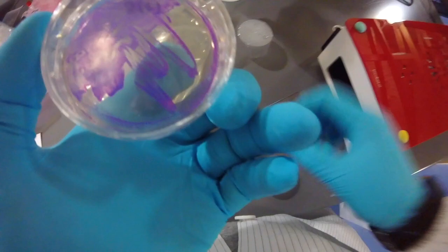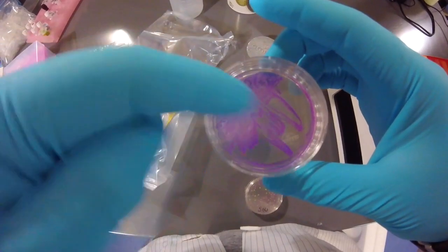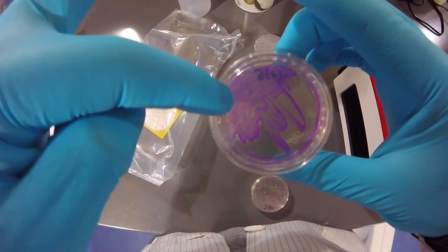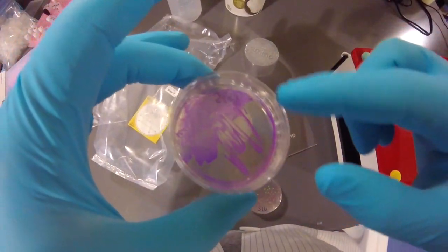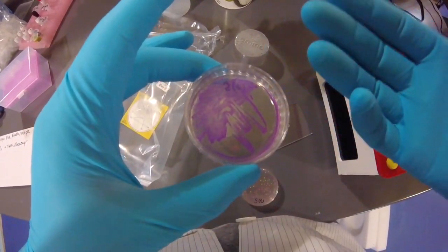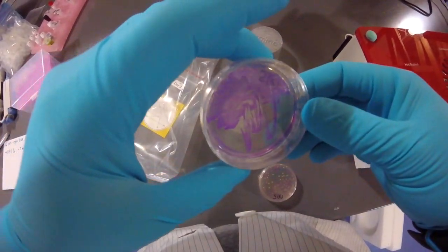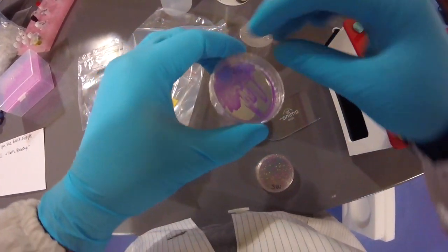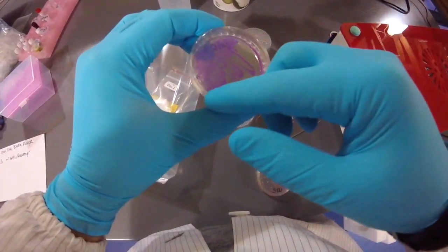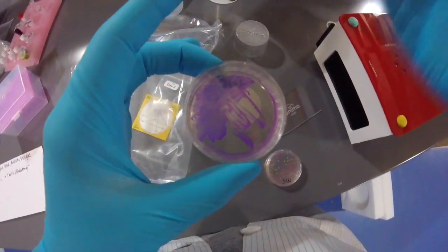All right, maybe I'll make a quick note about this. You might remember when I was streaking, I streaked mostly in this area here, right? I definitely did not take my loop and streak around this edge down here. If you ever see that, it's generally because there was some water or liquid on the surface of the plate. Then you streaked, and a little bit of bacteria might have gotten into the droplets. As the plate is handled, especially if it's rolled around, that droplet, which has bacteria, rolls around here and deposits cells as it goes. So if you ever see that ring, it basically means there was some liquid on the surface.